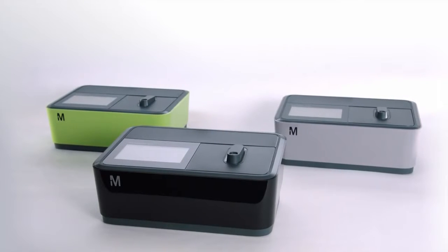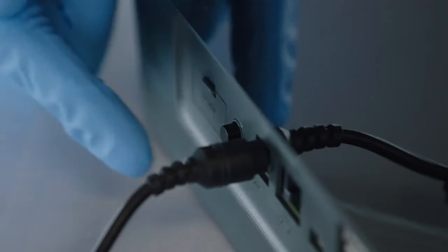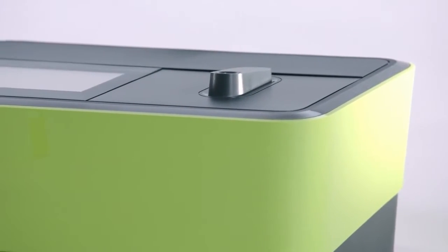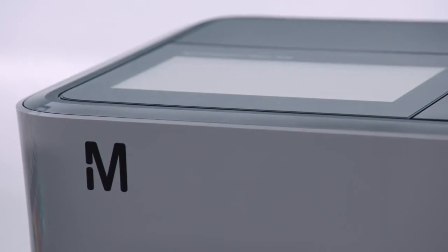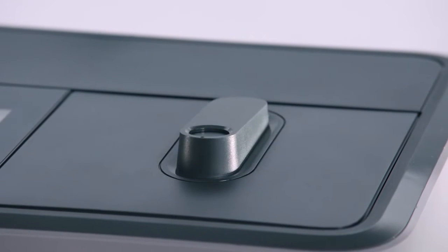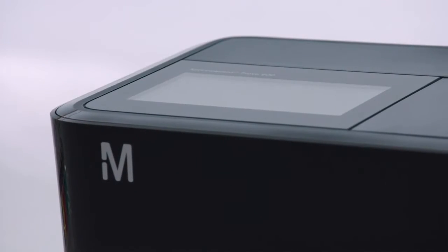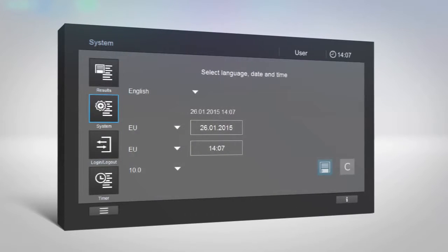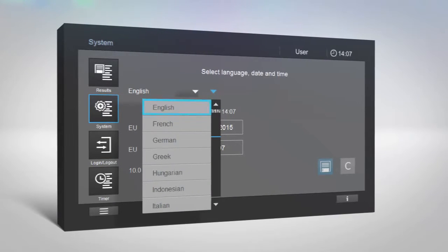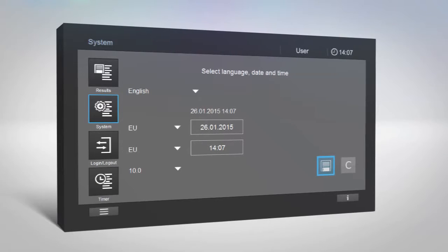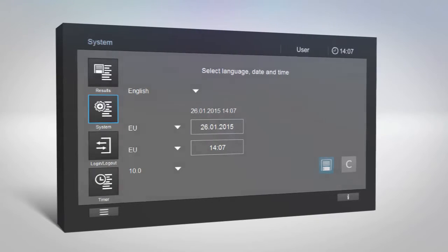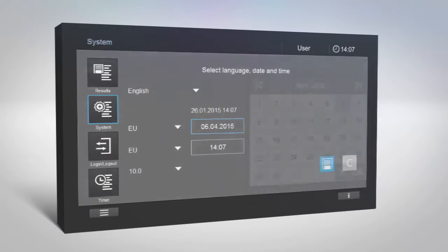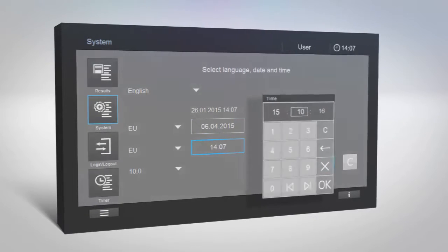SpectraQuant Prove supports several languages. When you switch on the instrument for the first time, a list of language options is automatically displayed after startup. After the first switch on, you can select any language of your choice. Choose Instrument Setup, then select Setup 2. Select the desired language and tap the Save button to confirm. Then select the desired date and time and tap the Save button to confirm.